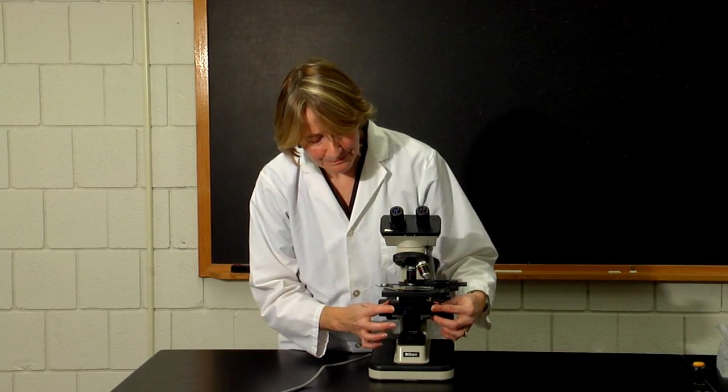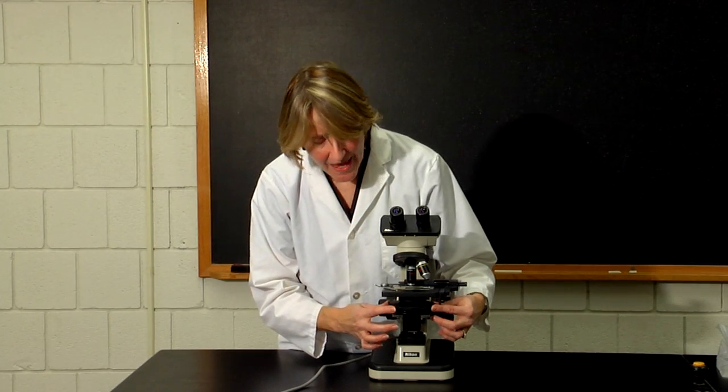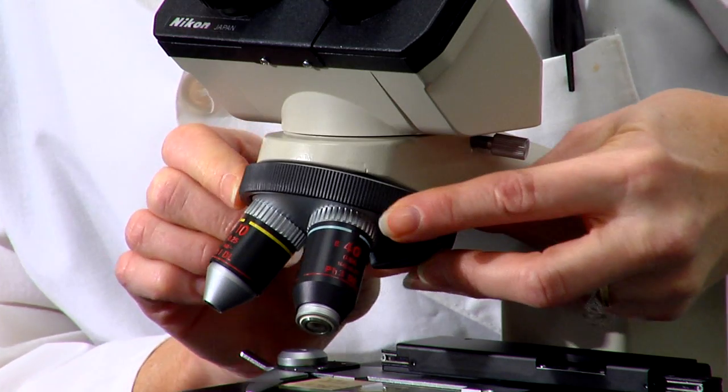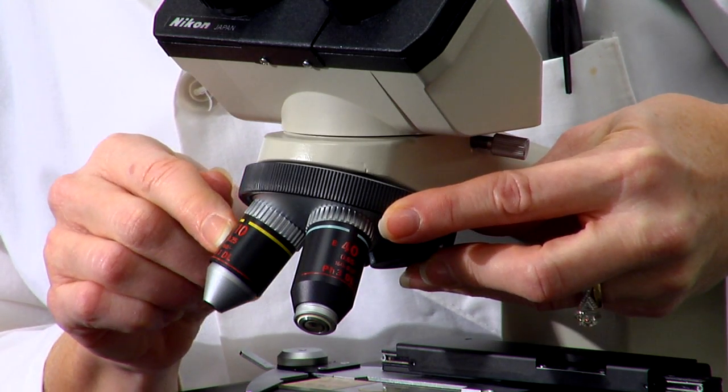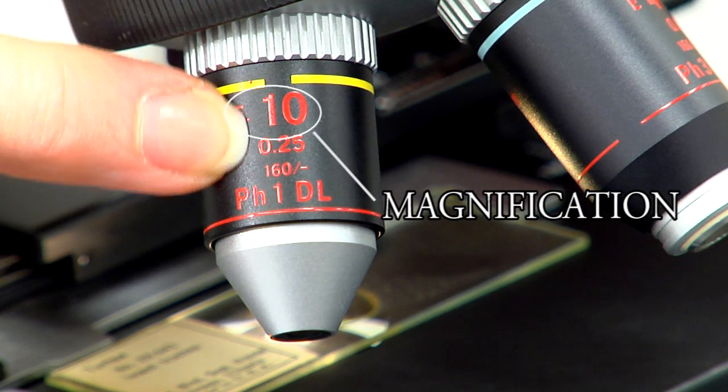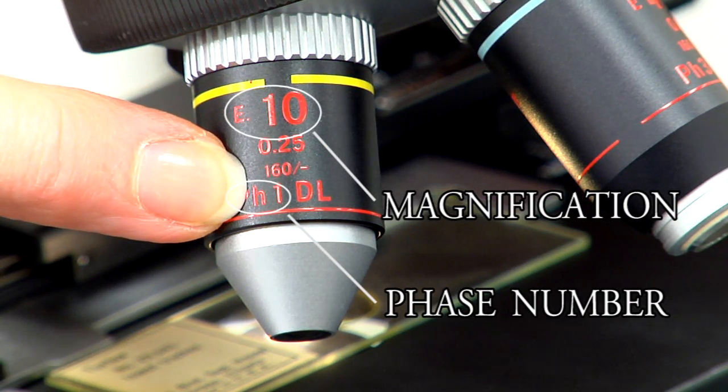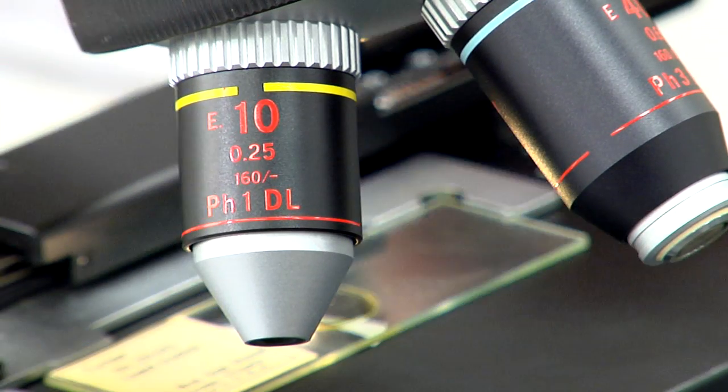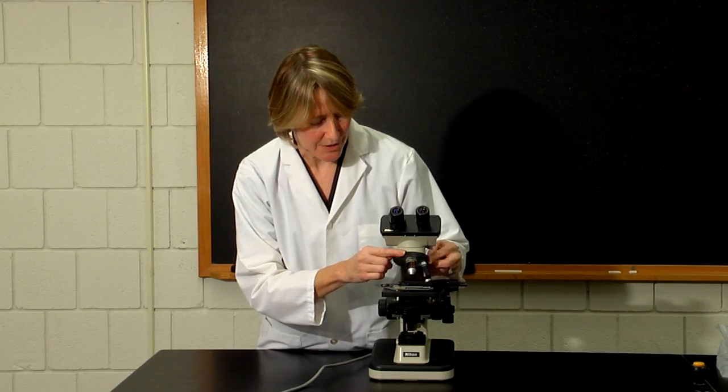For phase contrast, each lens uses a different phase contrast lens system, and you can look at the individual objective lens. Each objective lens will be marked not only with the magnification, but also with a Ph number, and this tells you which adjustment to make in the condenser lens system.